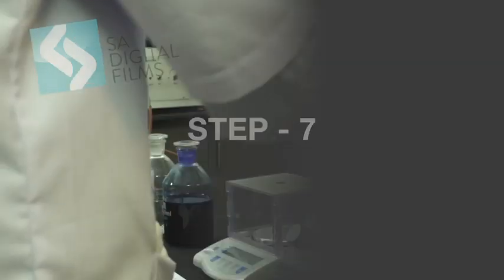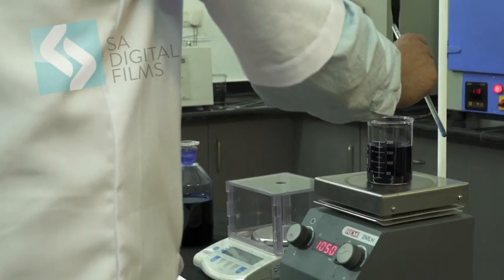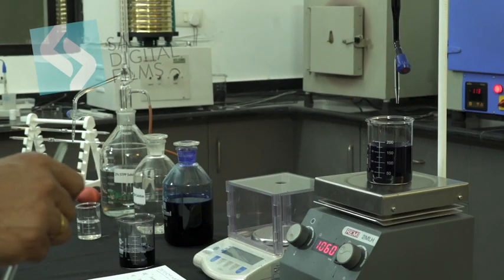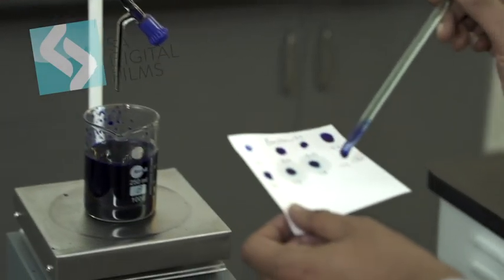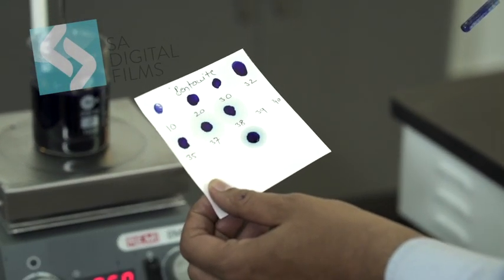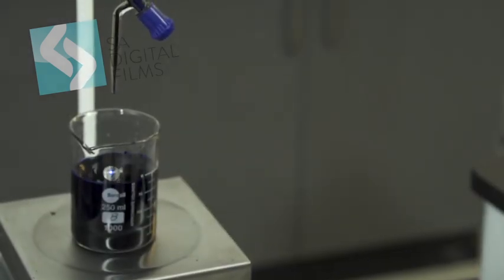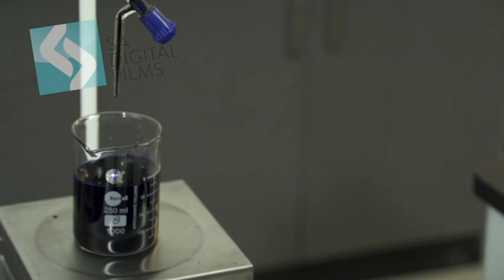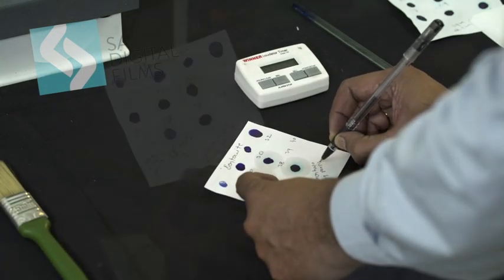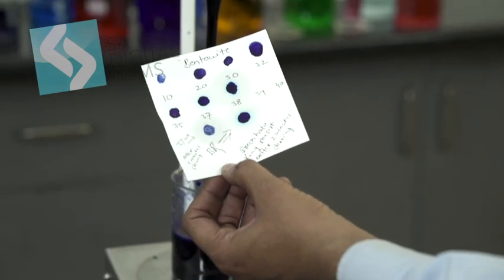Step 7. The sample is titrated by methylene blue in 1 ml increments, followed each time by 2 minutes of stirring until a blue-green halo appears, surrounding the dark spot of the filter paper. Step 8. The end point is then checked by giving suspension another 2 minutes stirring and transferring a drop to the filter paper to be sure that the halo persists. This indicates the completion of the titration.